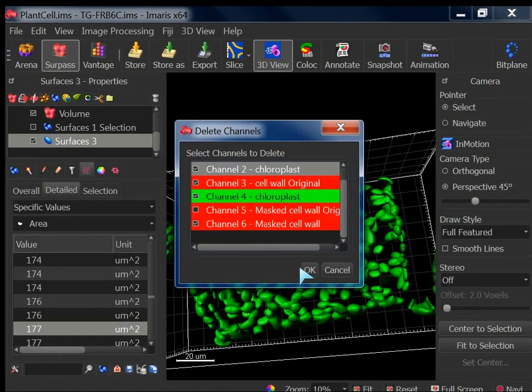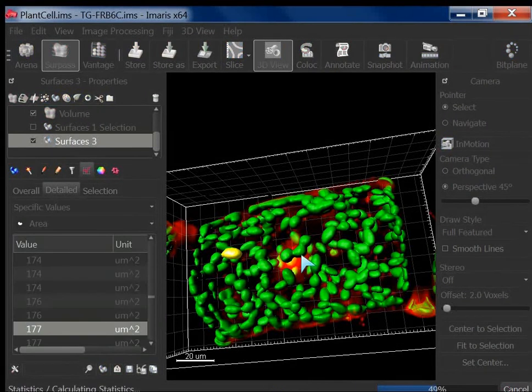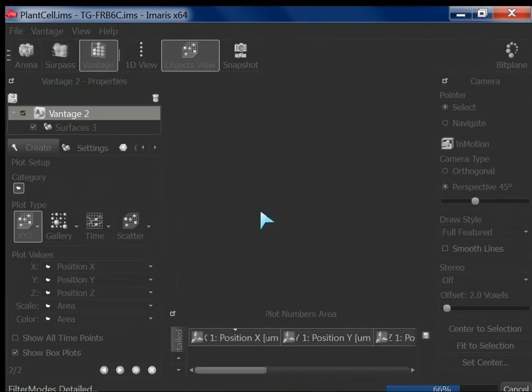Yeah, I understand. I think that's a limitation. For them, it's just a one-line code change, instead of ranking by number, just go by name, right? But then still we will have confusion because we have many different names. So now we have done this. And the duplication. Yeah, exactly.